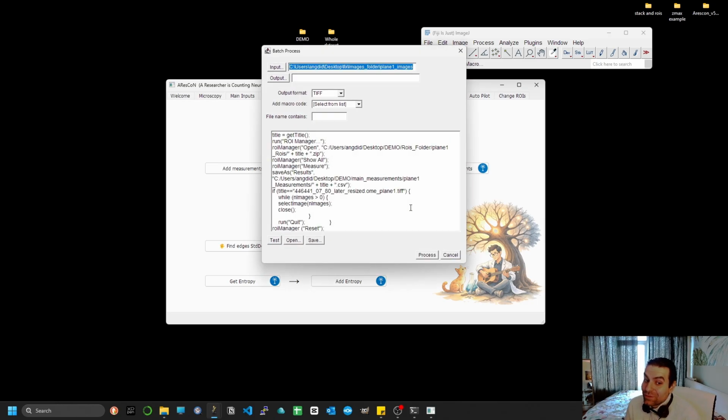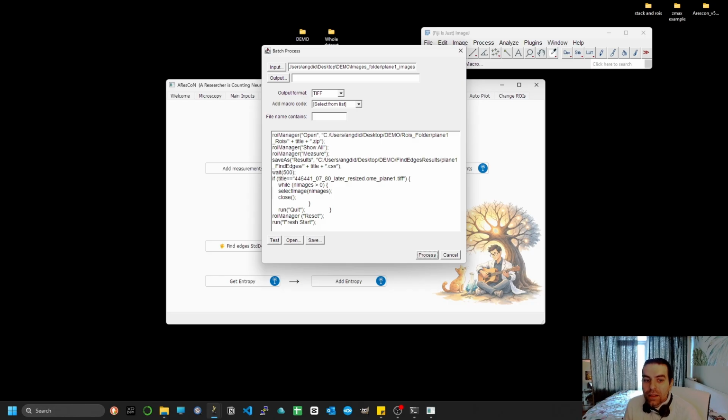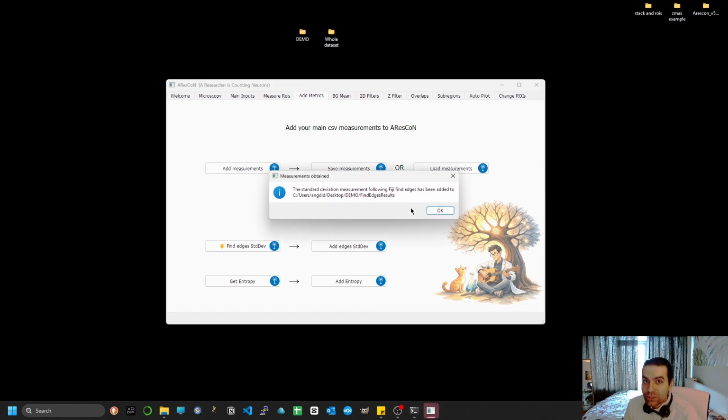Okay, so what find edges is, I also explained in the first video. It's just a Laplacian equation that accentuates the contours of your cells, and by doing that, actually you're getting a higher standard deviation when you're measuring the entirety of your cell. And the higher the standard deviation is, it actually probably means the more crisp is your object compared to the background, because its contours have a lot of intense high values that create a higher variance.